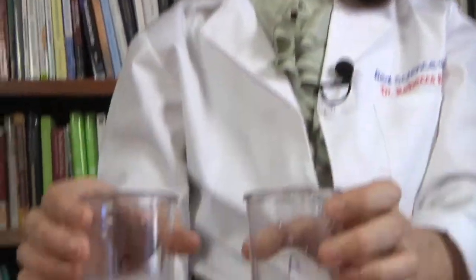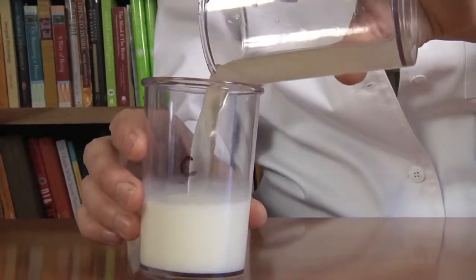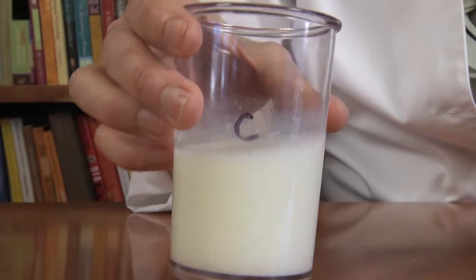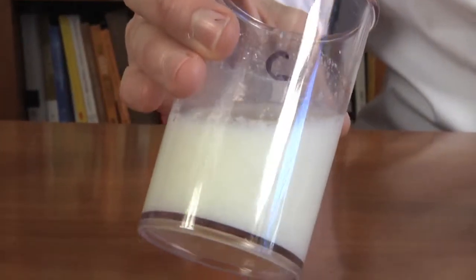Now we're going to look at what happens when we add A to C. But before we do that, we're going to take a guess. What do you think will happen if we add A to C? My gut feeling is that when I add A to C, there's going to be a chemical reaction and C is actually going to get a little clumpy. So let's find out. I'm adding A to C. And sure enough, this is getting a little bit clumpy. You can see it's starting to form a kind of milky precipitate.